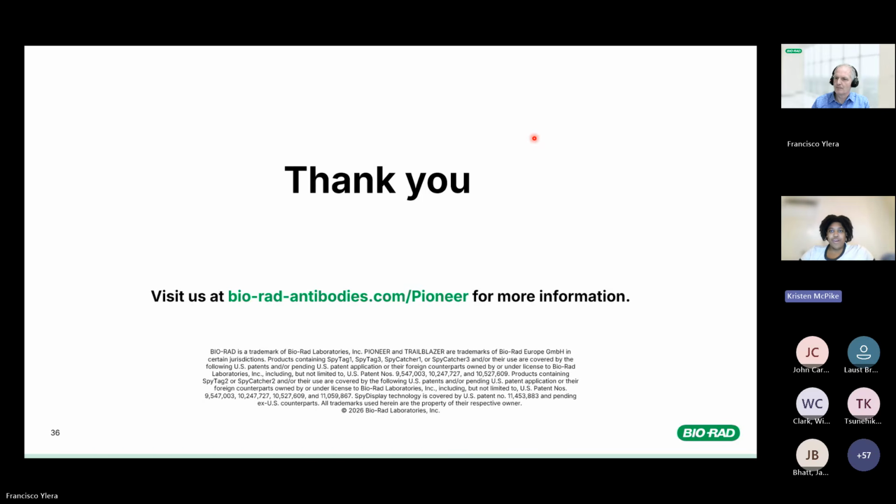Then just a couple more. One from Sophie Gabriels. On the developability parameters, all tested clones pass the polyreactivity test. How is this determined? And how often do you observe polyreactivity for other clones? Finally, is a synthetic library more prone to enriching for aspecific binders? Let's start with the last question. We don't observe that the synthetic library is more prone to unspecific binders.